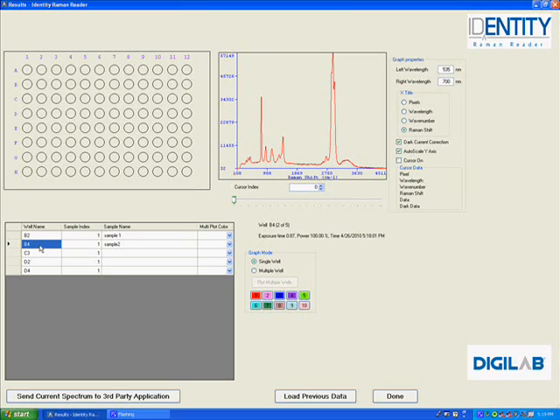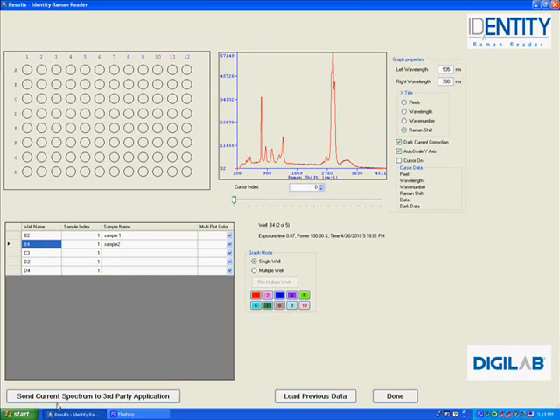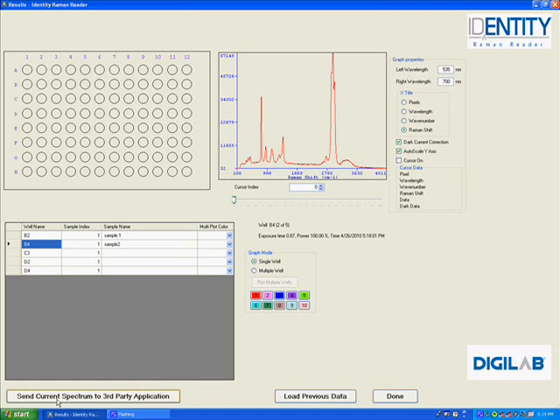Once I have selected a spectrum and I would like to do further work with it, I can go down to this button on the bottom, send current spectrum to third party application, and do further processing with it at that point.